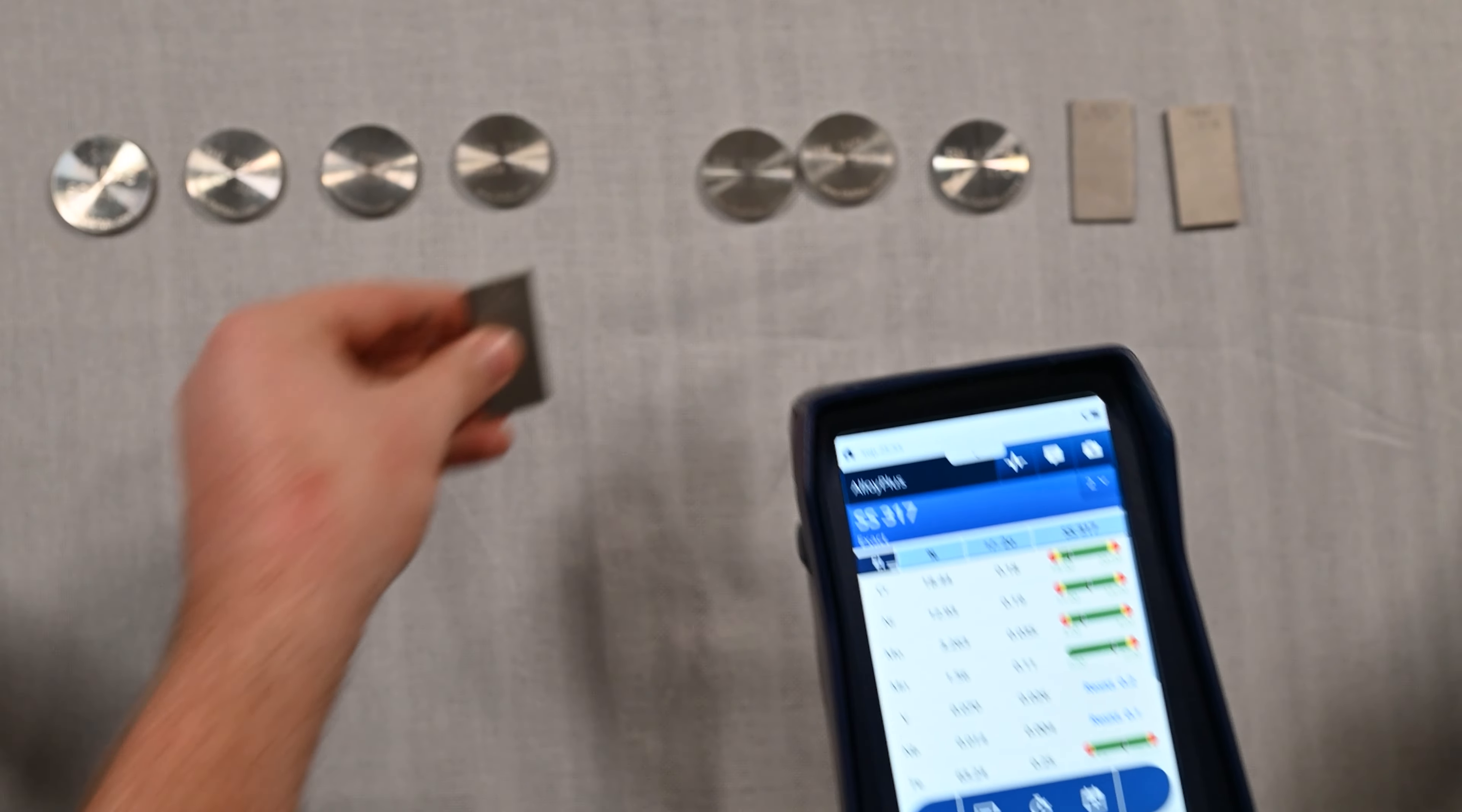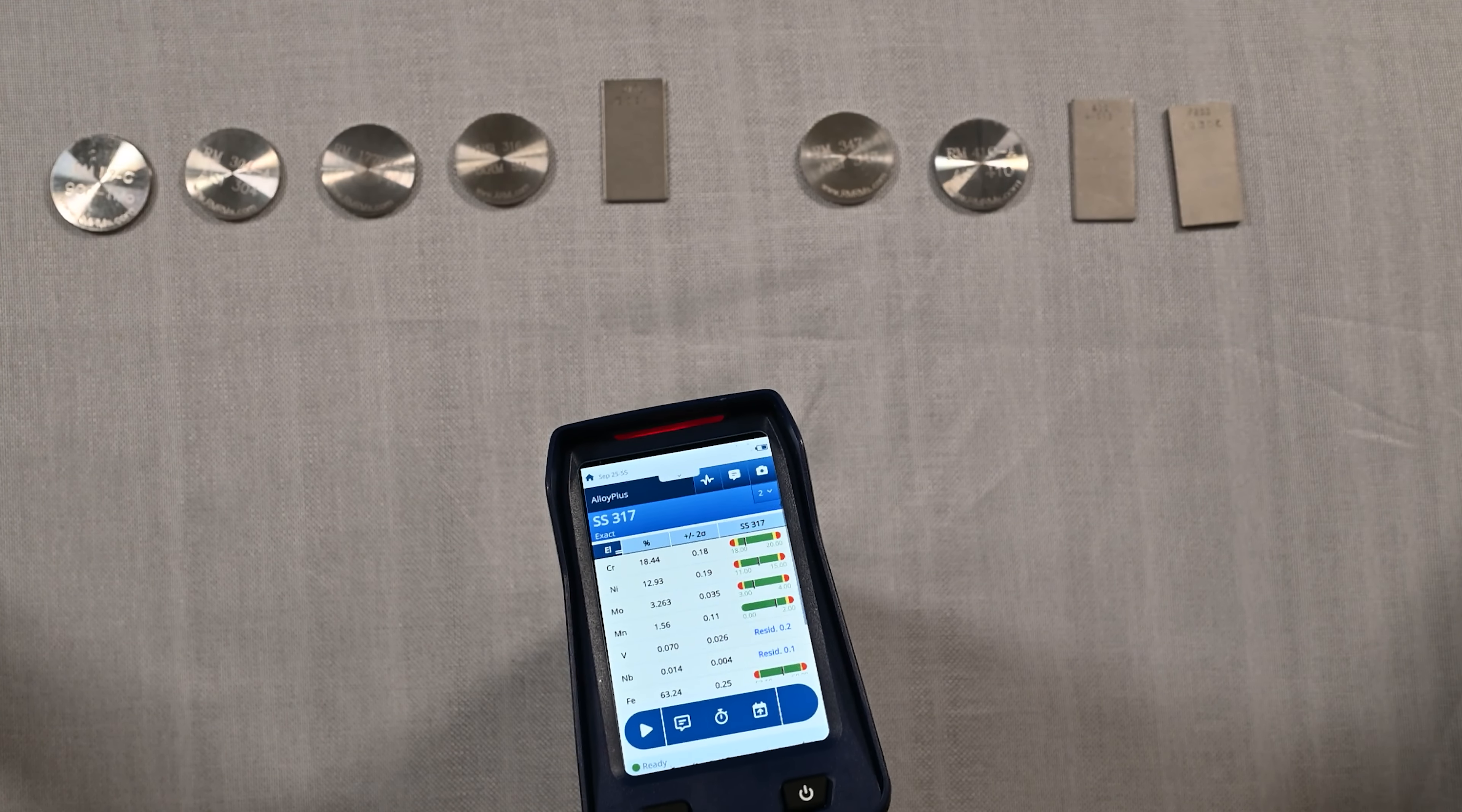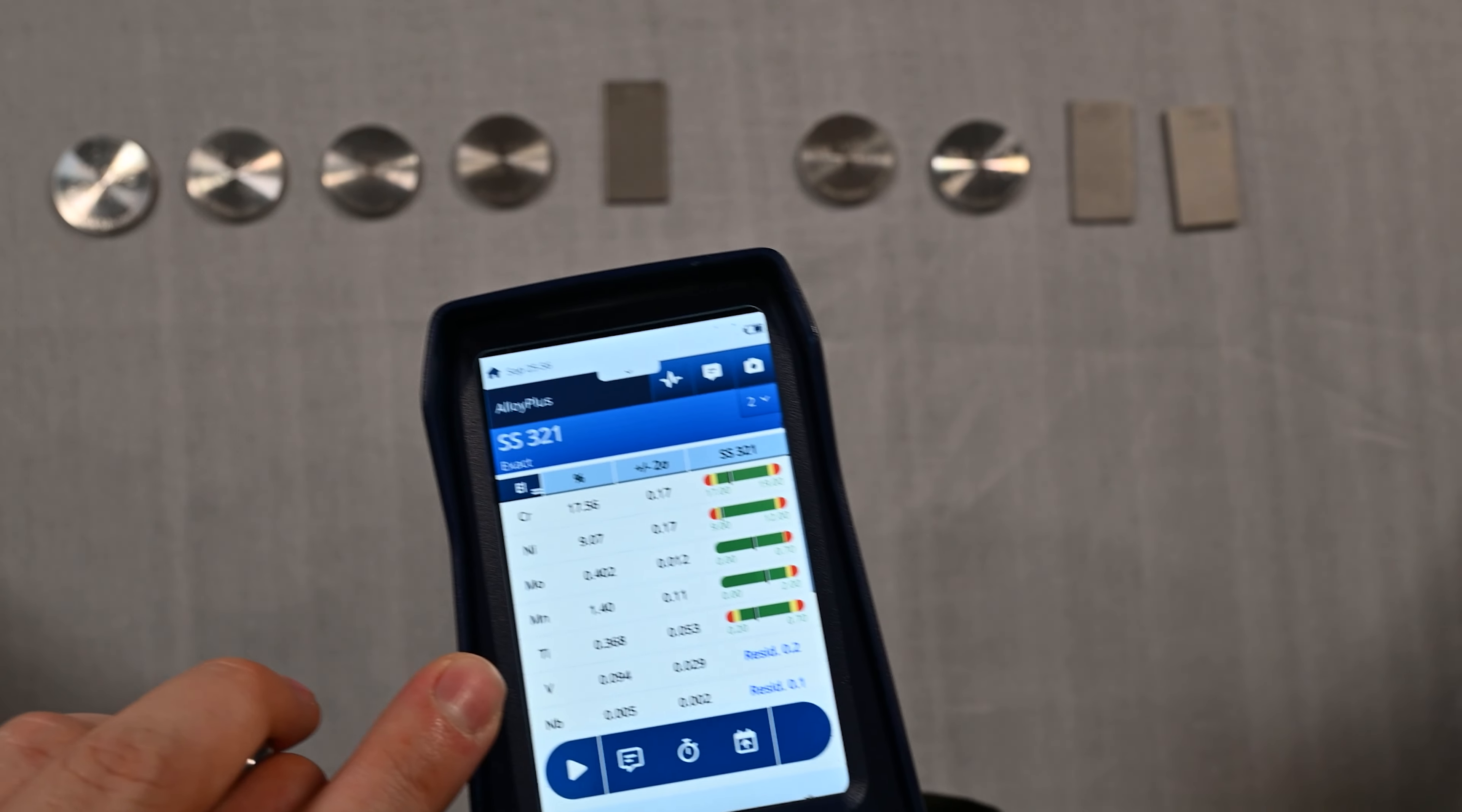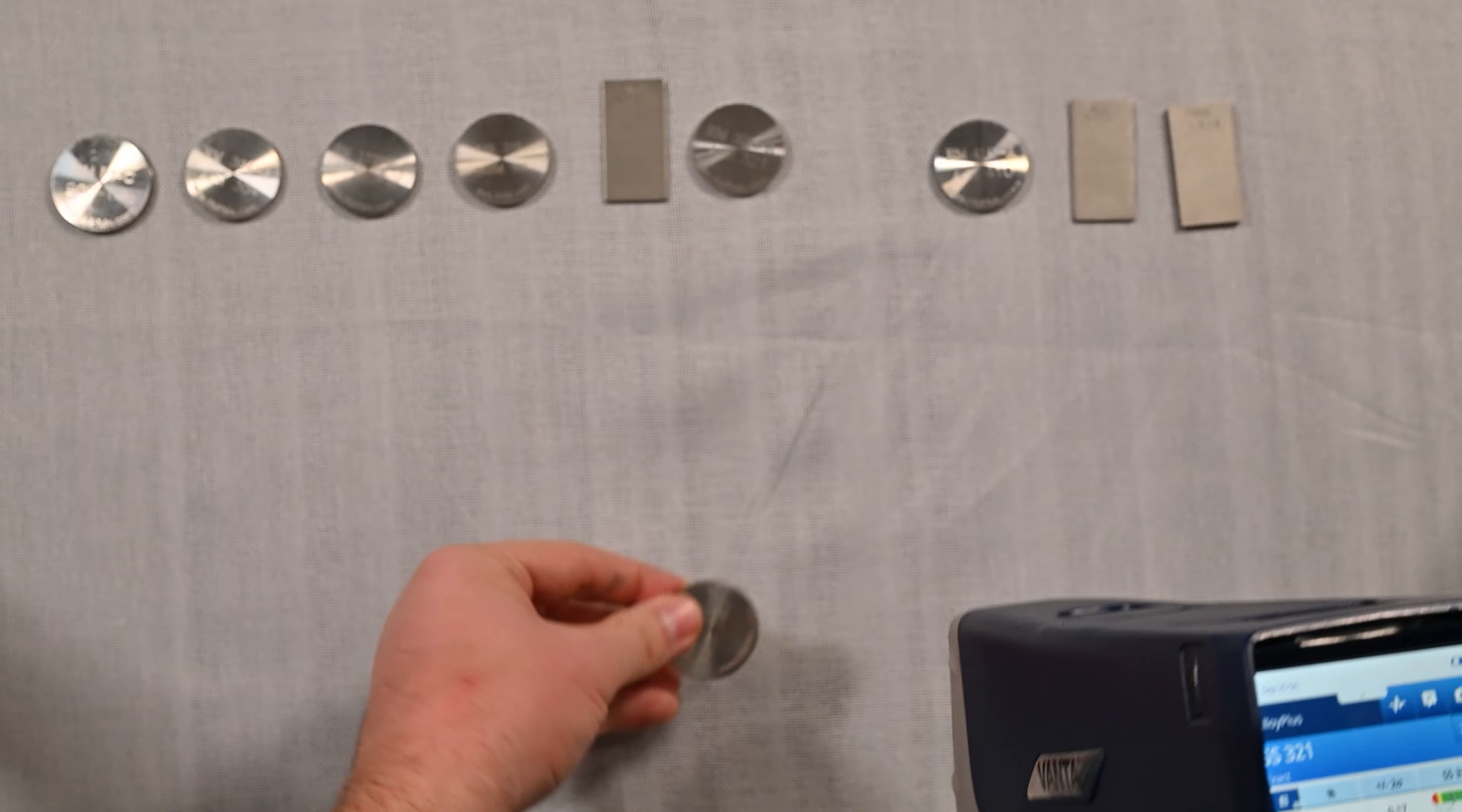Next up we've got 321, which is similar to a 304 but it has a titanium addition to it. So we have to see if this analyzer is able to sort that properly, and it looks like it is. That titanium addition, which you'll see down here, is able to be detected with this XRF technology. The Vanta Core, being a newer XRF, is very fast, very snappy, very sensitive to those elements.